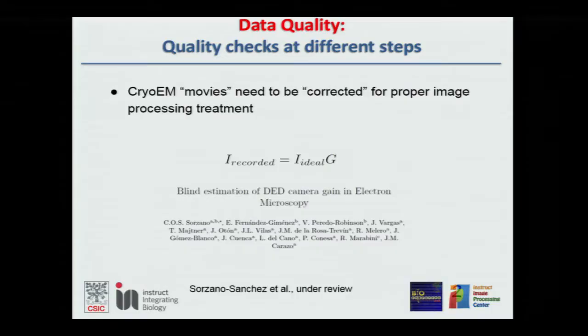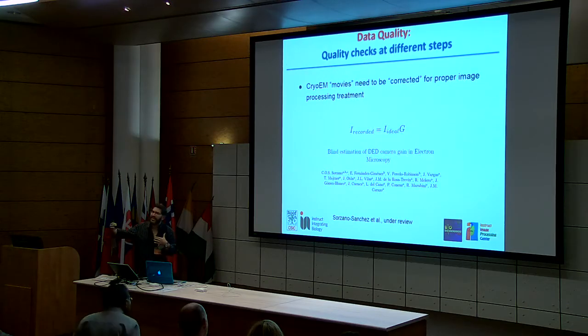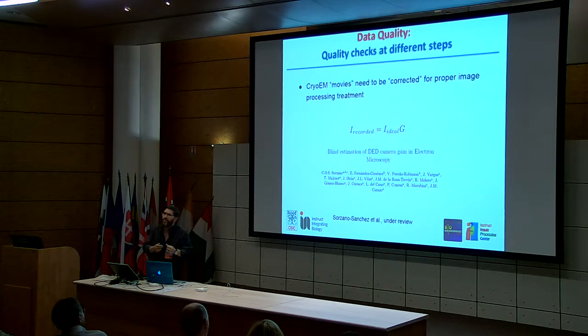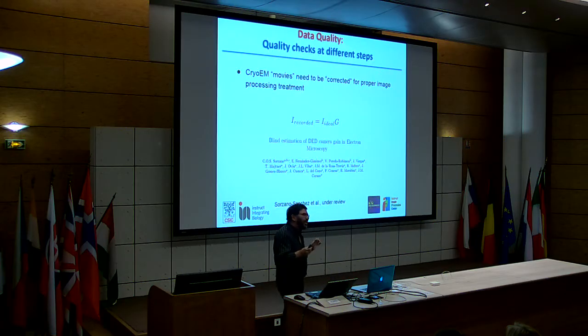And there we have started from the very beginning, from the notion of getting your image to actually getting the final model and even getting the map. Let me present the latest work, perhaps, that is still not published, on a very simple thing about attaching a quality string to the data you are collecting.